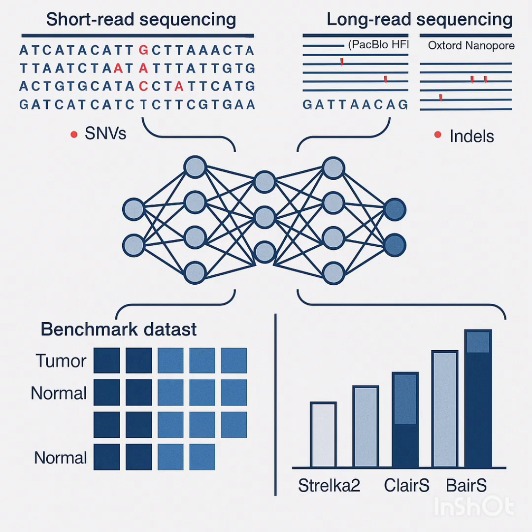Okay, so let's zoom out. What DeepSomatic seems to have achieved here is, wow, pretty remarkable. A highly accurate deep learning tool for finding these crucial small somatic variants. It works with both short and long reads, and it adapts to tough, real-world situations like having only the tumor sample or dealing with degraded FFPE DNA. That sums it up nicely.